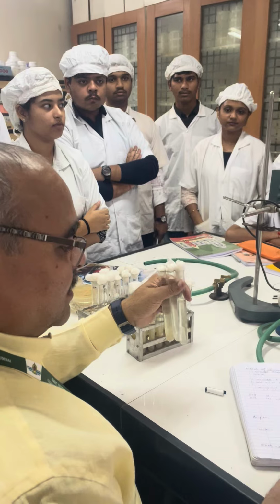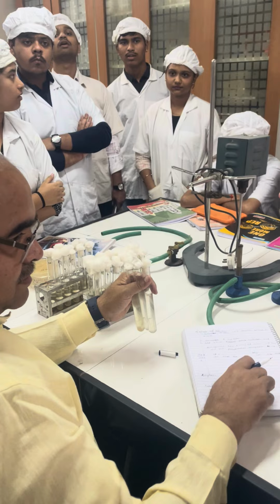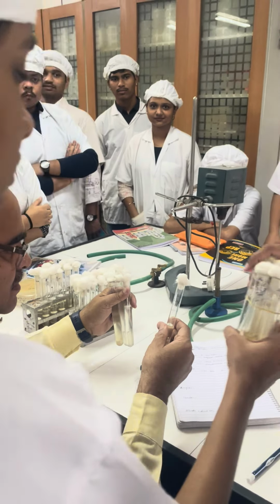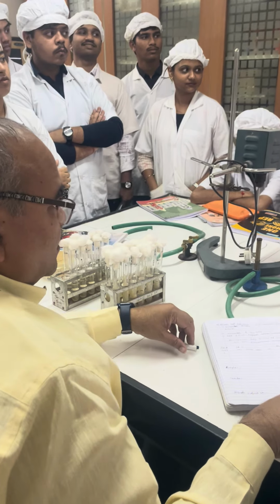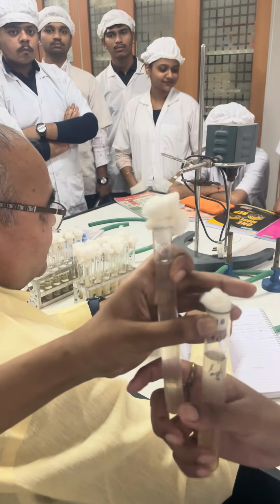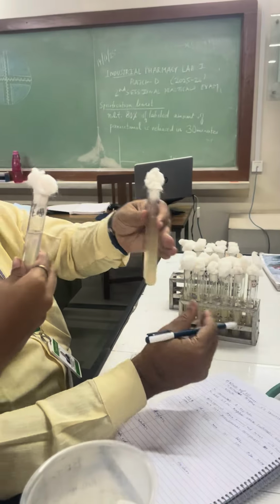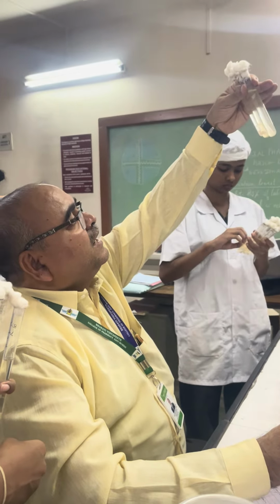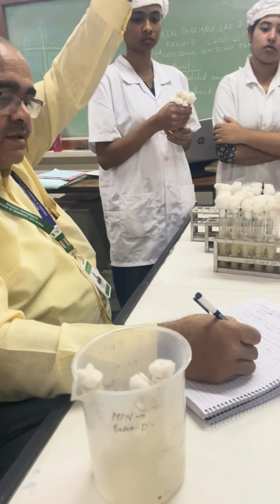Next. This is tap water, right? Yes sir, W1. See the second test, 1 ml. W2 sir. For W2, take out the 10 ml. This should have been arranged. I have not taken that one. Bring the test tube stand. This is what? W2. In this, see the number of test tubes showing acid and gas production. All three are showing, right? 1, 2 and 3. Right, here 3.